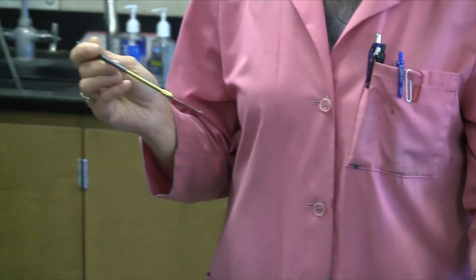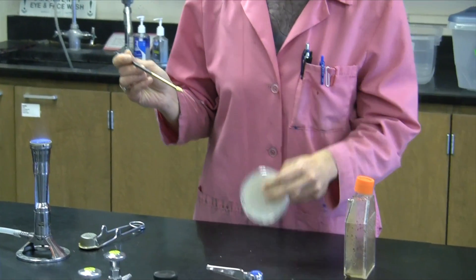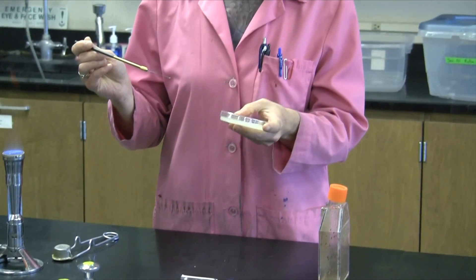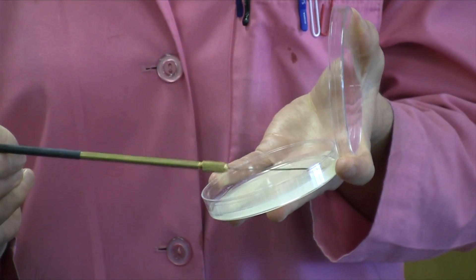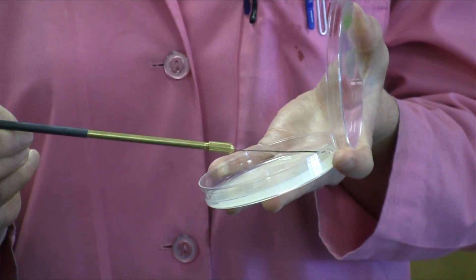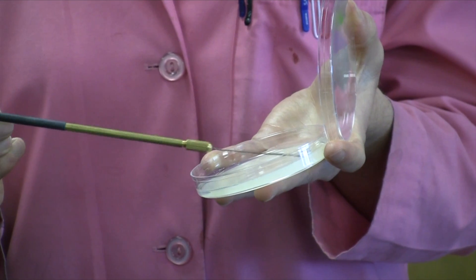We'll hope that next time we'll get a nice isolated colony of Azotobacter. Azotobacter looks wicked cool on this nitrogen-free agar — it actually looks like tiny little water droplets, the colonies that it forms. So we'll be hopeful to see some of that and possibly even some other types of colonies.